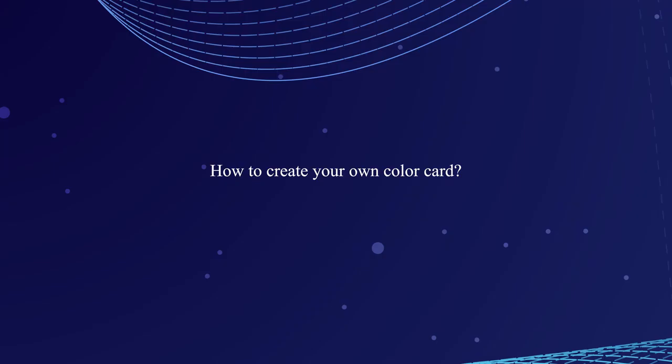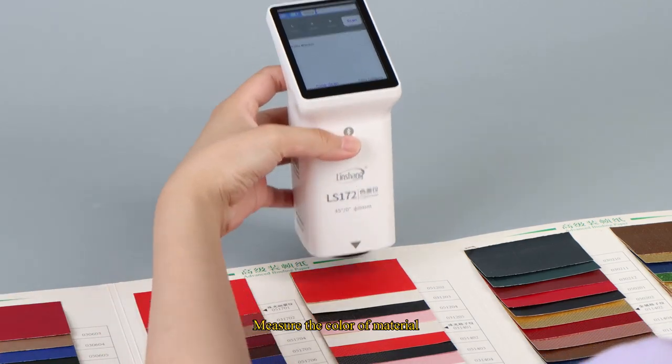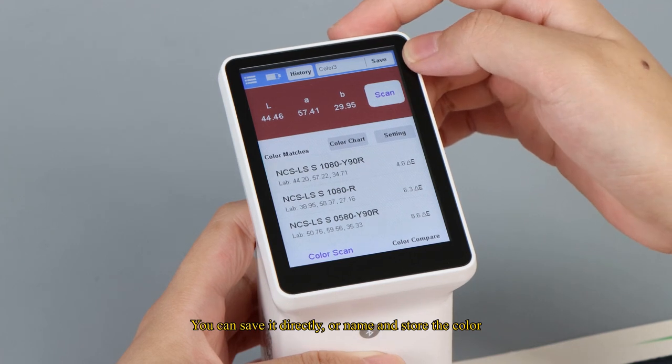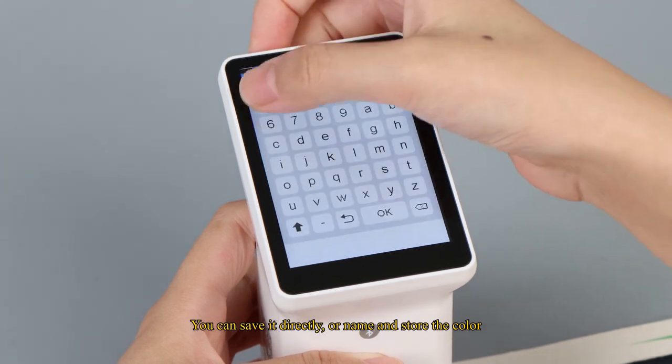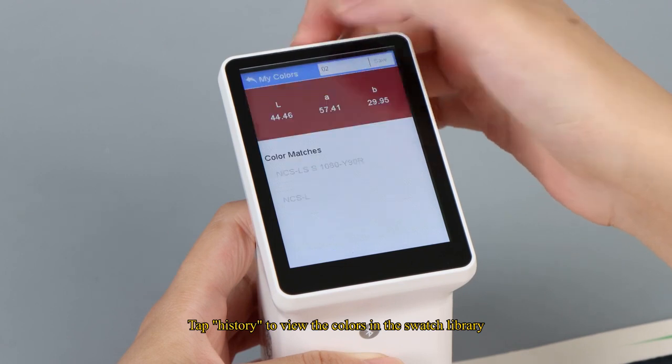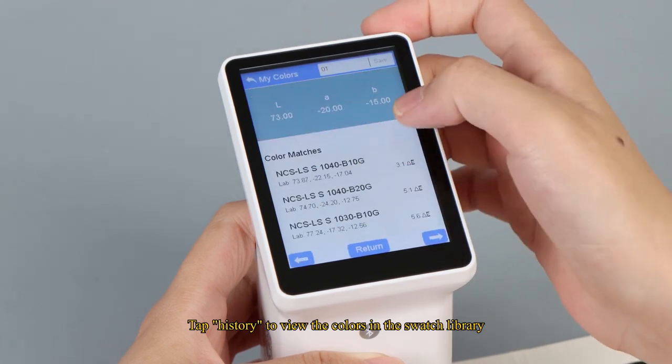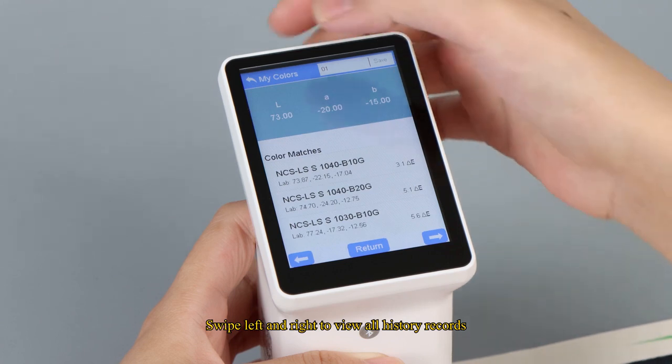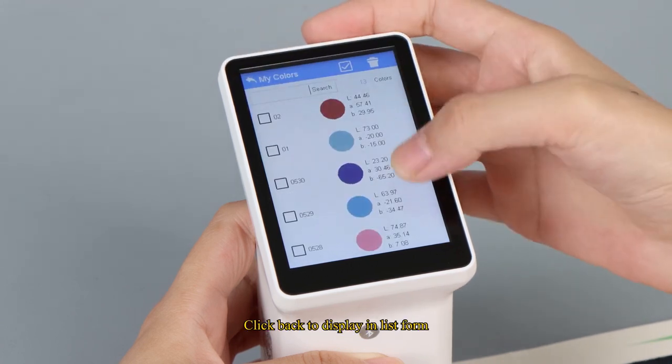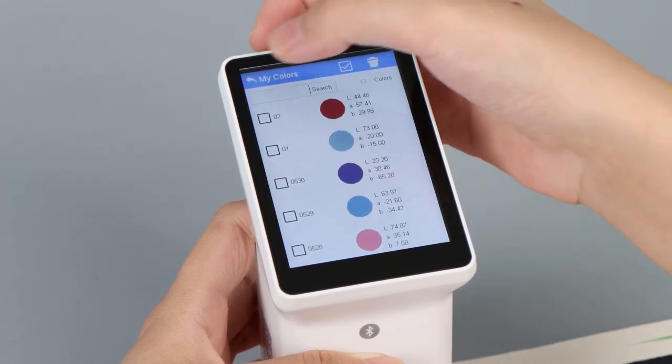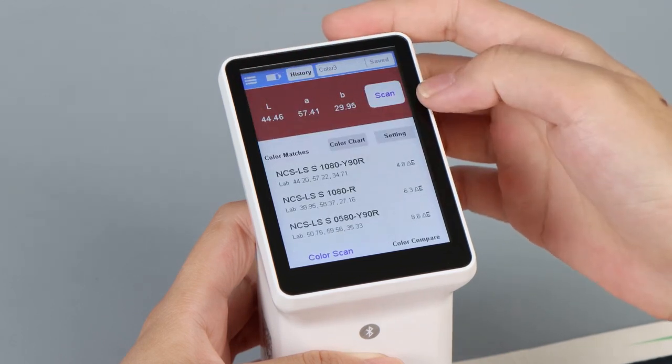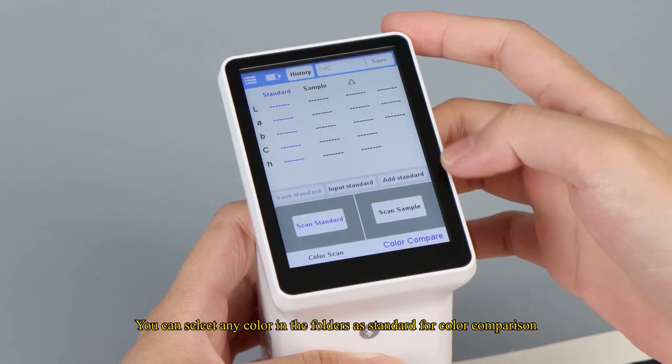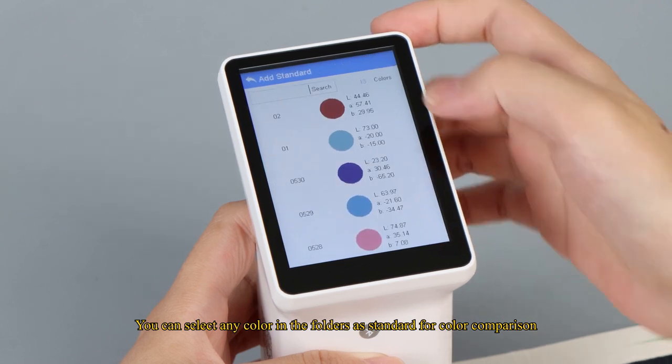How to create your own color card. Measure the color of material. You can save it directly or name and store the color. Tap history to view the colors in the swatch library. Swipe left and right to view all history records. Click back to display in list form. You can select any color in the folders as standard for color comparison.